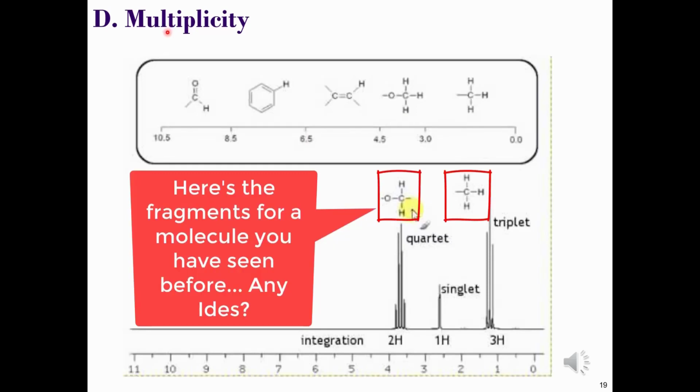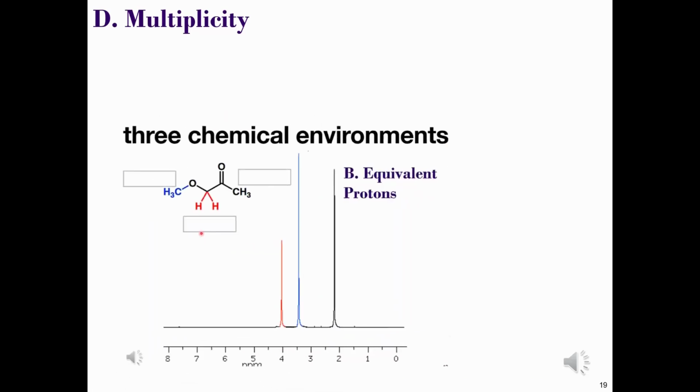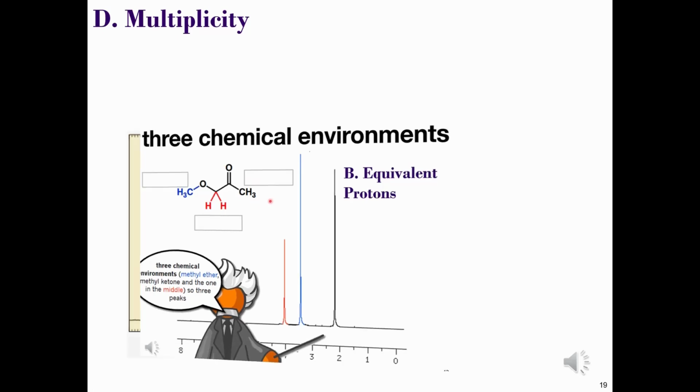So far, our discussion has not really involved the effect of any neighbouring protons, because all of the examples that I have used with you have been carefully selected to produce NMR signals which were all single peaks. That is, all of the protons in those environments were equivalent, but were unaffected by their neighbouring proton's environment. This was for the purpose of thinking about the number of chemical environments, the chemical shifts in which these signals were observed, and the integrals of these signals.